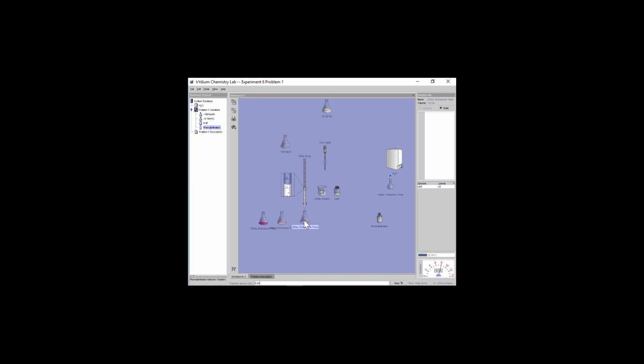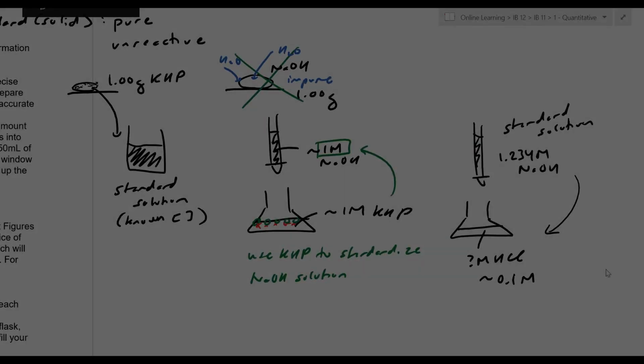All right. So with that, we're going to switch over to the OneNote. I'm going to crunch through these numbers for you. We'll see how we do, make sure we understand the technique of a titration, and then we'll come back to this just for practice here. How can we actually do the dilution, and how can we do the second set of titration?